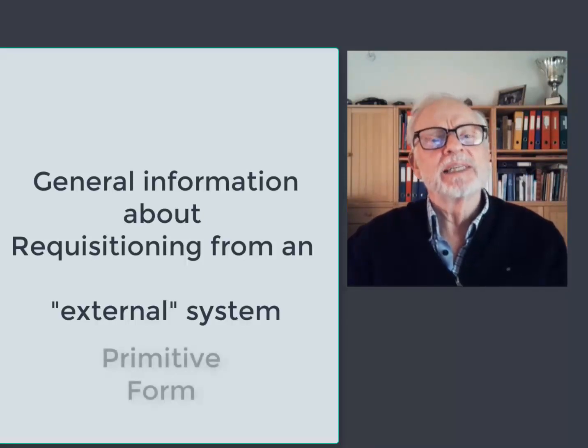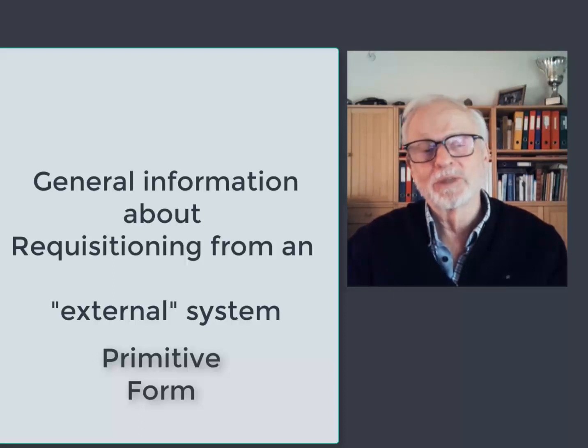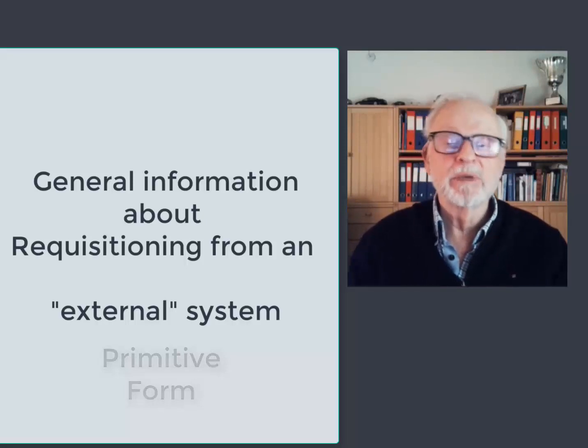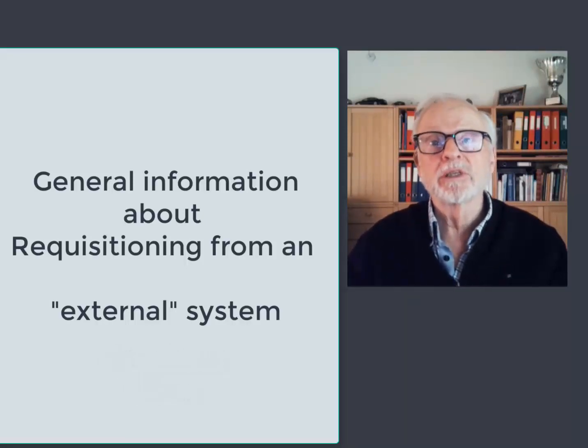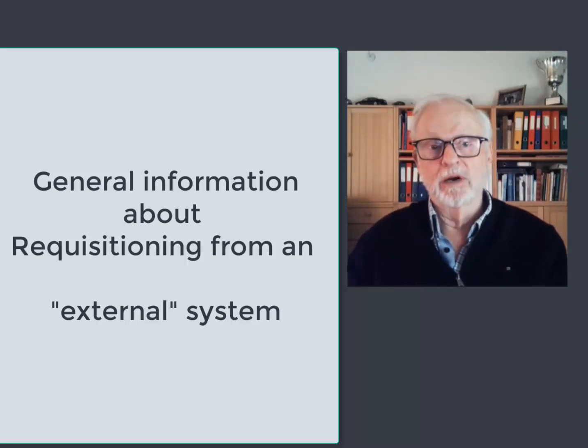Why primitive? That is because the condition around the patient changes. It is in principle difficult to correct information that has been handed over to another IT system when the condition changes. It is often complicated, especially if accounting issues are involved. And there are continuous changes, not only in the intensive care unit in a hospital. For example, it may be difficult to change the requisition after dispatch, perhaps because the PTB has been printed, sampling may be underway, or analysis may be in progress. Some of the responses have been returned or printed, and other additional analyses have been carried out on the material, etc. Conditions which must be taken into account.